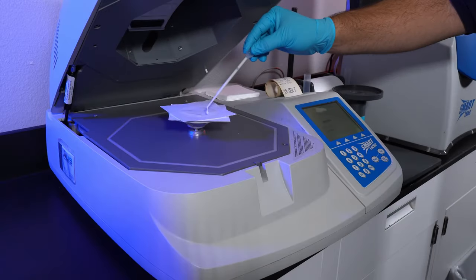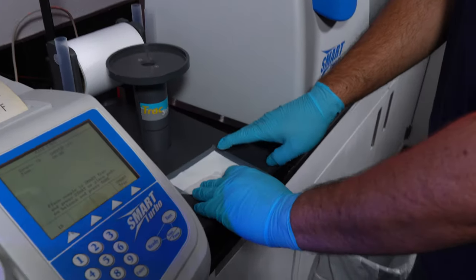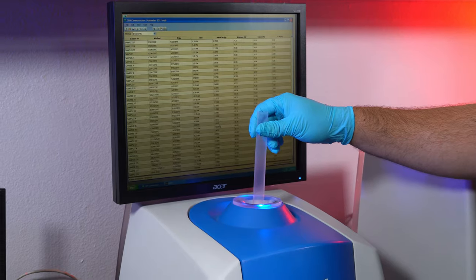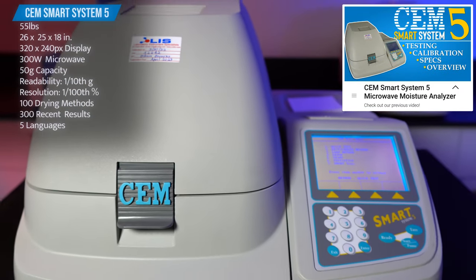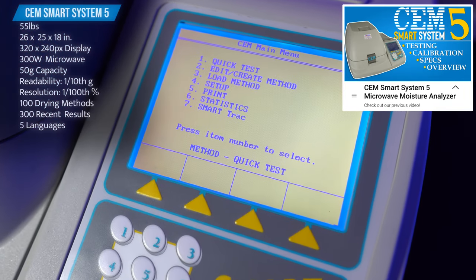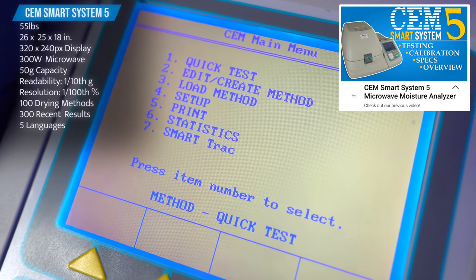Now into testing samples. Here is a quick overview: we will first remove the moisture with the SmartTurbo and fold our sample in the SmartTrack film at the SmartTrack Station, then place the sample into the SmartTrack to analyze the fat content. I highly recommend checking out our previous video on the CM SmartSystem 5, as the SmartTurbo has the exact same specs and we go more in depth regarding the usage of that instrument.